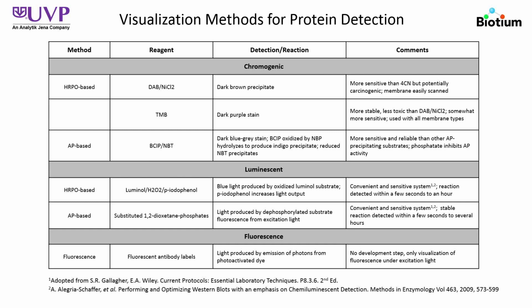Now, to improve the sensitivity and linearity, and in fact to create a better way to store data, many labs have moved to chemiluminescent imaging. With CCD capture in particular, you get a wide dynamic range and a great deal of sensitivity using the same two enzymes, HRP and alkaline phosphatase.